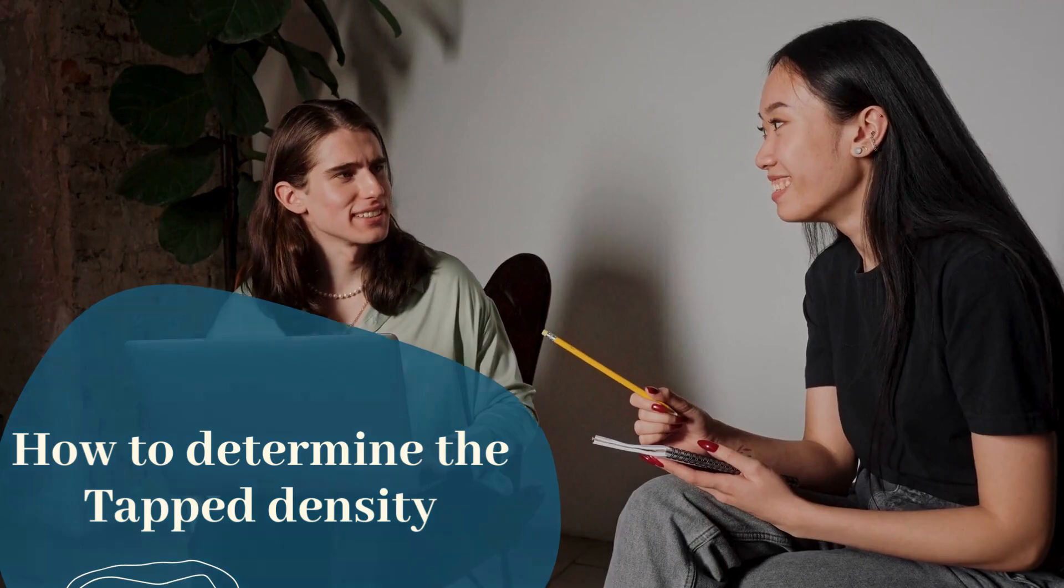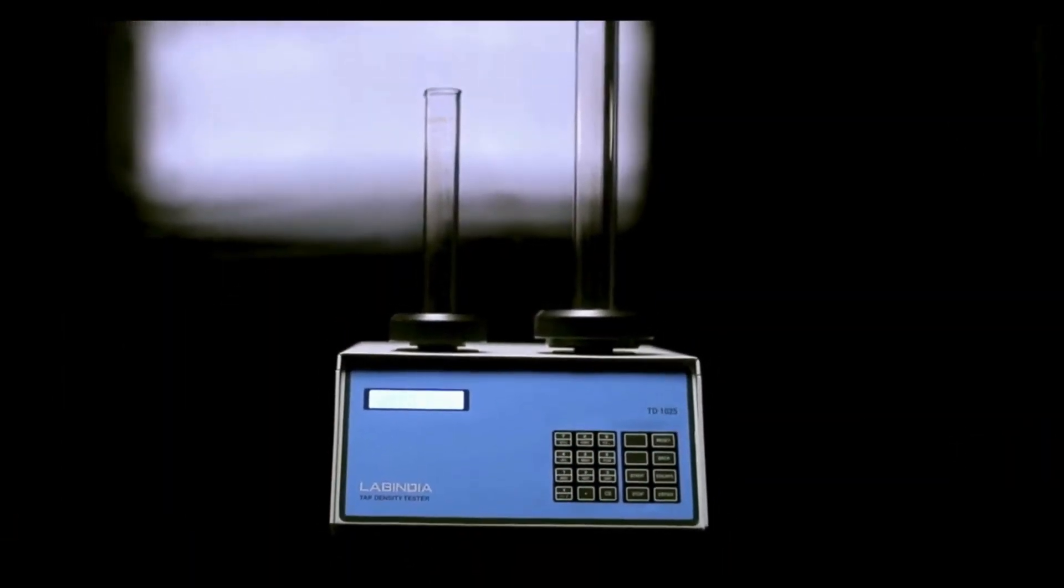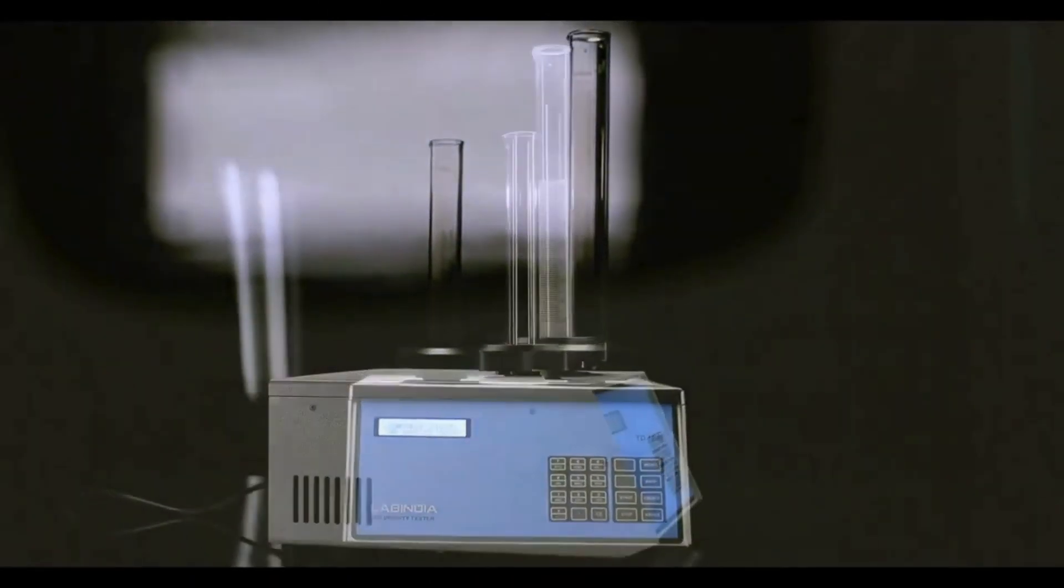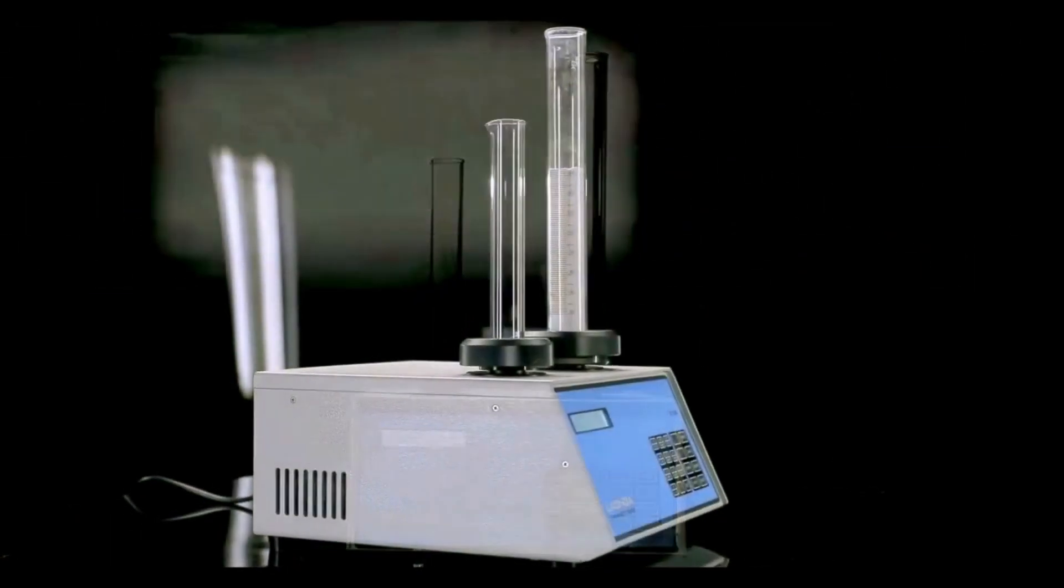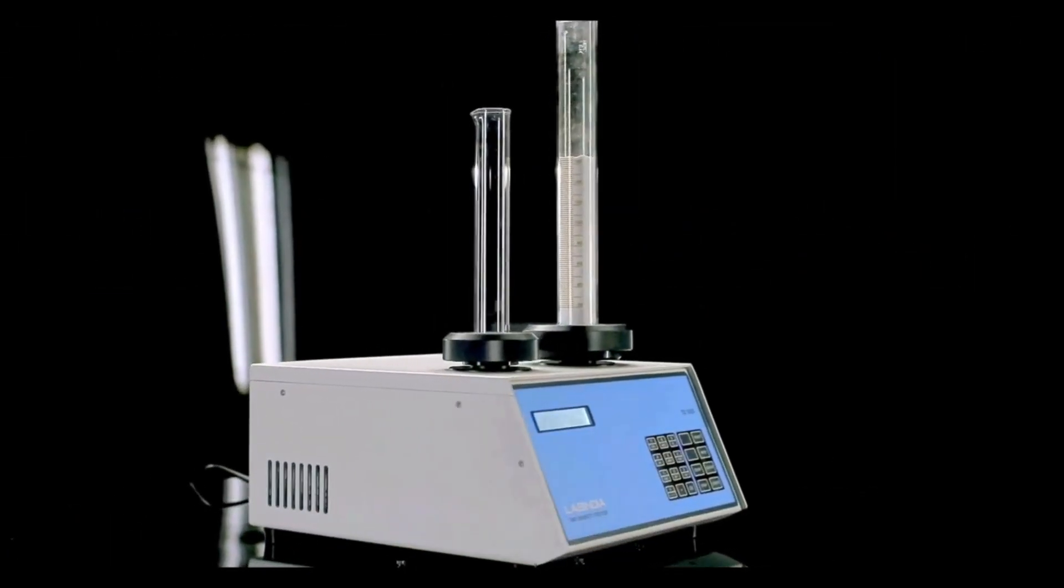How to determine the tap density? Check that all the connections of the instrument are proper. Weigh the sample and fill it in a measuring cylinder of the tap density tester.